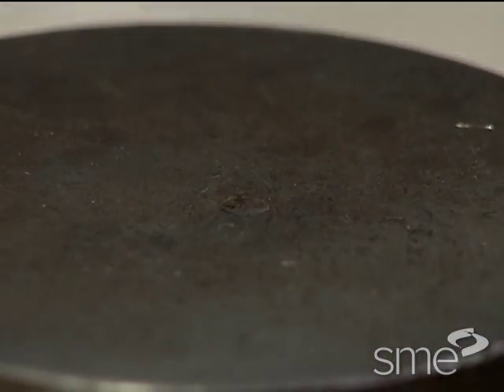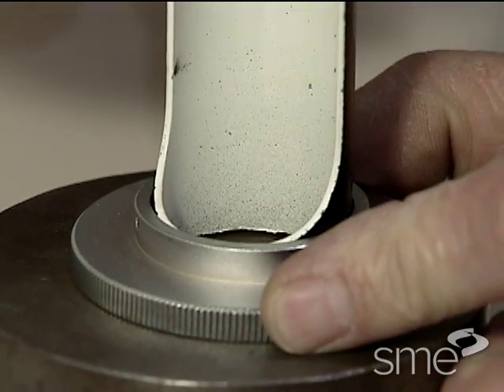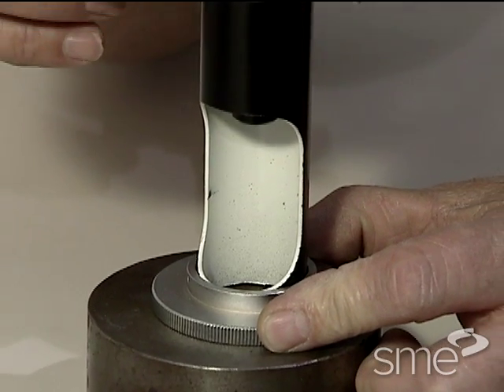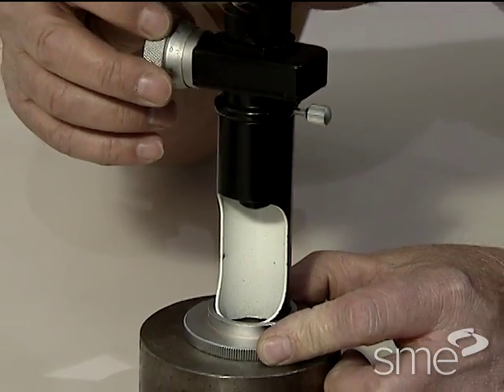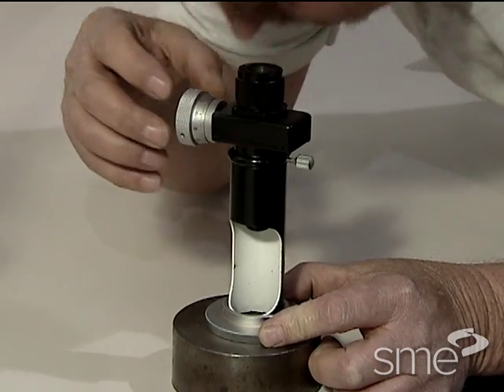A microscope especially designed for the Brinell hardness test is generally used for diameter indentation measurements. This microscope permits measurement estimates as minute as two-hundredths of a millimeter, or eight ten-thousandths of an inch.